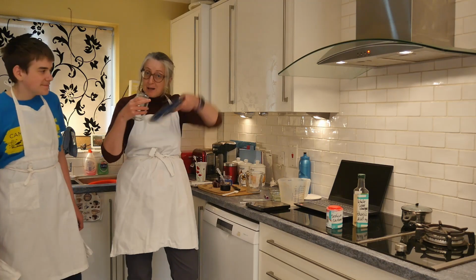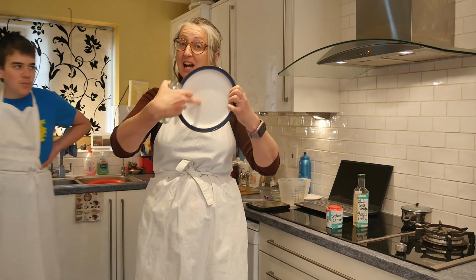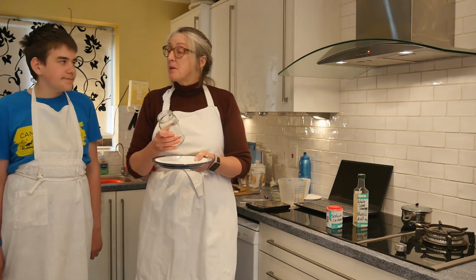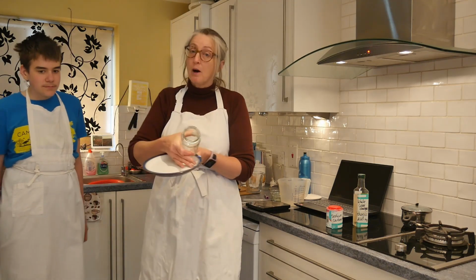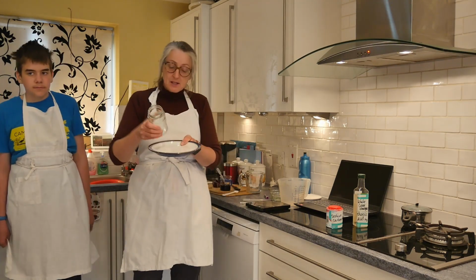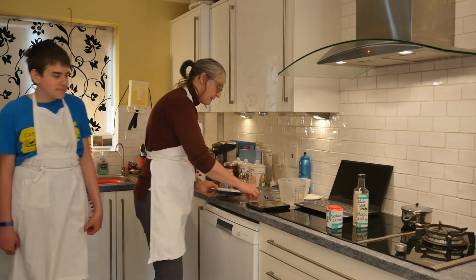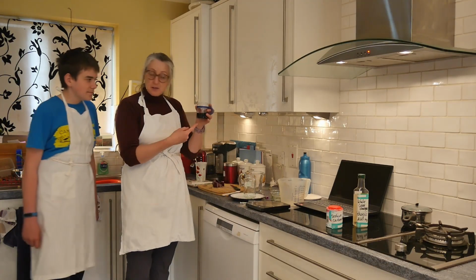Okay, so you'll notice I've got a plate. If I just get close to you there, you'll see that my plate is actually white. It's important, if you are going to use a plate, that you use a white one, or just get a piece of white paper, or a white tile if you've got one. You might not have a white tile, that's quite rare actually, but anything white over the top of your plate, you can tape it in place if it's a piece of white paper. That's because you need to see the colour change clearly, and you'll see the colour change better on a white background than on a coloured background. And there's the red cabbage indicator waiting.